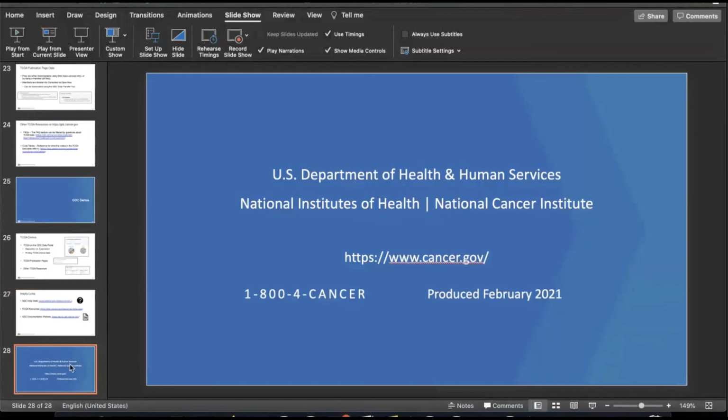Okay, great. Thanks, Bill. There's a couple questions. If folks can put their questions in the Q&A section, but we do have a couple of questions. The first is, what is the general depth of coverage for whole exome sequencing for FFPE samples? Ooh, that's a good question. I don't know the answer to that, but feel free to follow up on the help desk, and we will contact our bioinformatics team, who should know this.